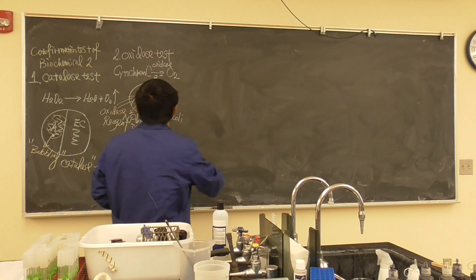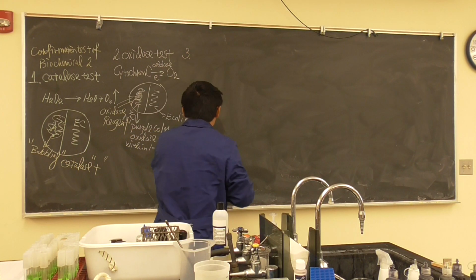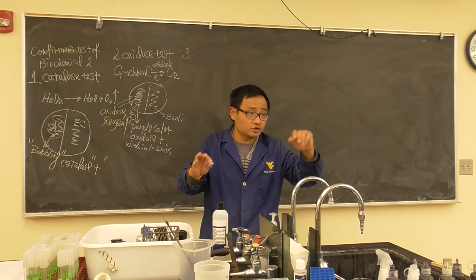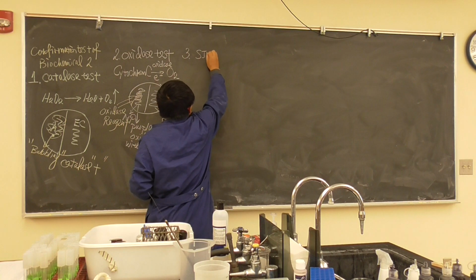Okay, this is number 3. They add the drop there. You can just wait and you can see the color later on. Then take a picture. SIM test.